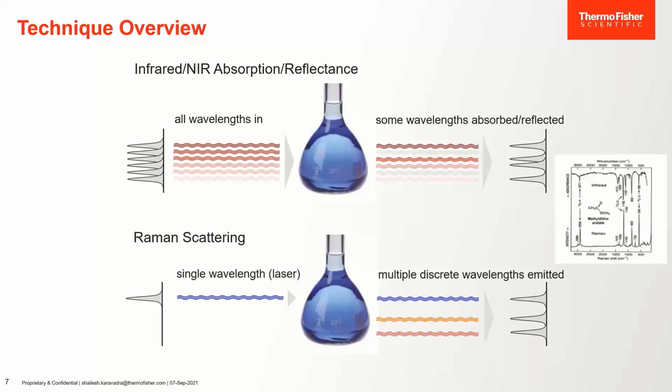And with Raman, the first step to produce a Raman spectrum is to illuminate your sample with a light source such as a laser. This scattering of light is a minute fraction of the light that you shine with the laser, perhaps 1 part in 10 million. And therefore you need an excellent detector which can capture this low amount of light which has gained energy, for example.